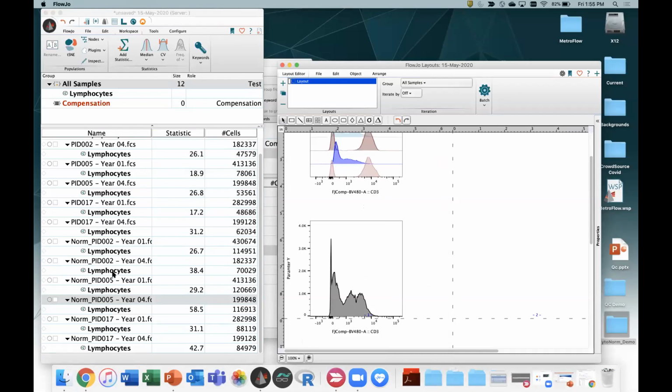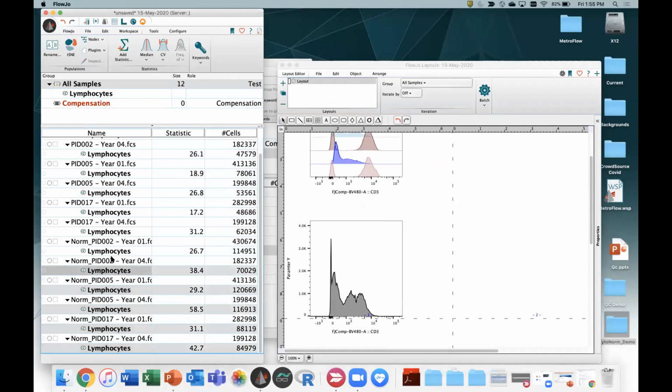Just to let you know, John, we have about 5 minutes left. Sounds good. This is the last thing we're showing, just an overlay here of each of these.